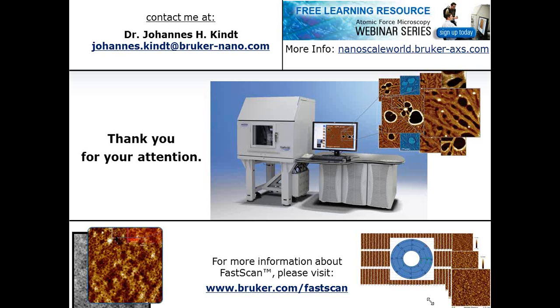And actually, maybe this is where the question comes from. If you look very closely at the diatom image, what you see is the frustule, and it is hard, with low adhesion. If you then look at the individual holes, they are soft with high adhesion, but in the stiffness image there's actually a small dip in the center of the holes where there seems to be high stiffness again. I would guess that is probably a sidewall effect happening in the deepest region of that hole. So one has to be aware of it, but like with all techniques, you have to know the limits of the technique and then exploit it within those constraints. Where the sample is sufficiently flat, which can actually be fairly rough, just not over 45 degrees or something, then you get very good data.